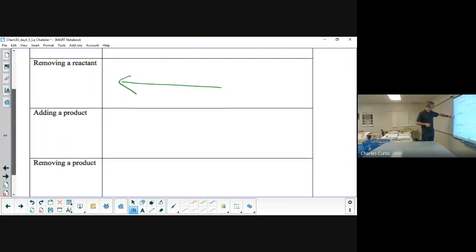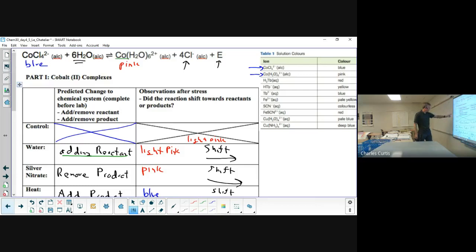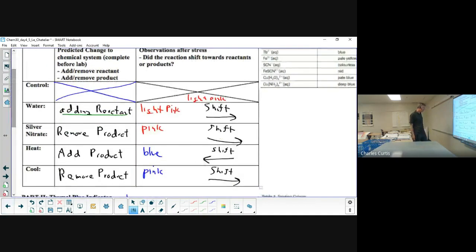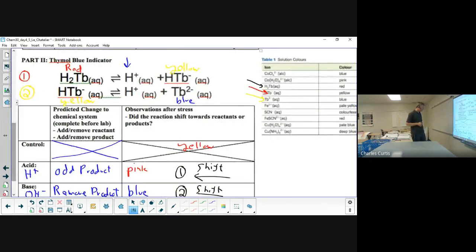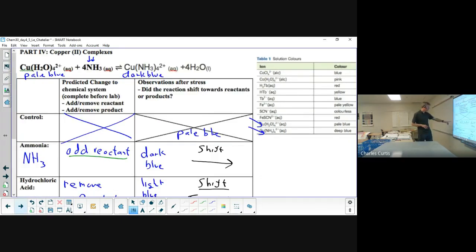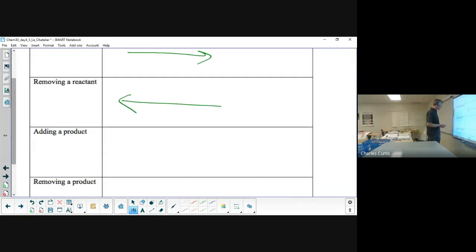Now you're going to have to articulate these arrows into words and write about a paragraph each, or a couple sentences for each of these boxes. Let's see, add a product. Let's go back through all our data. We added a product with the heating and it went backwards, so we got to remember that. Add a product again. We added a product with the acid and we went backwards also, so that's consistent. And that's it for adding products. So both of our trials, when you add a product, it went in the reverse direction. So let's see if we have a bit of a pattern, and then we'll do the last one.